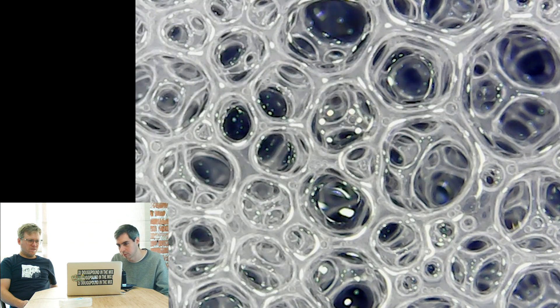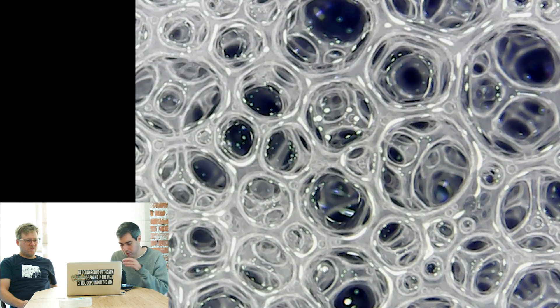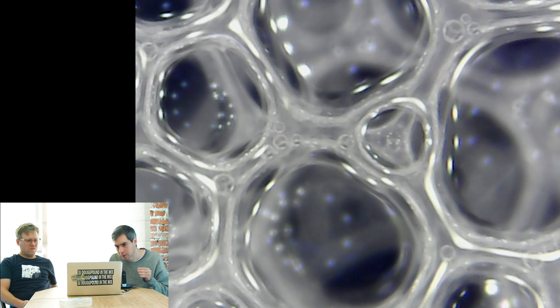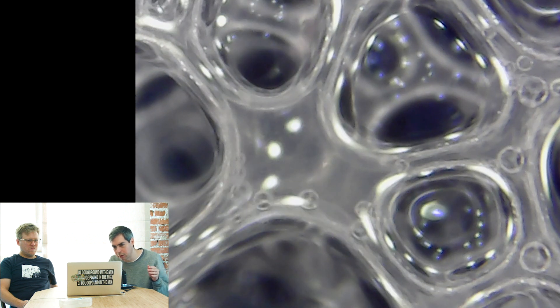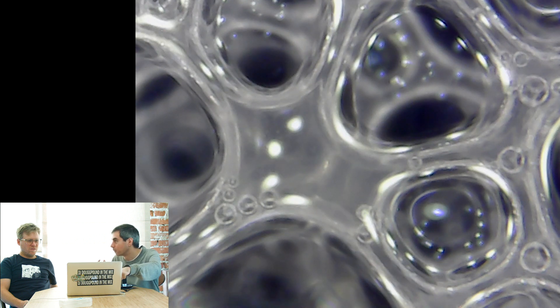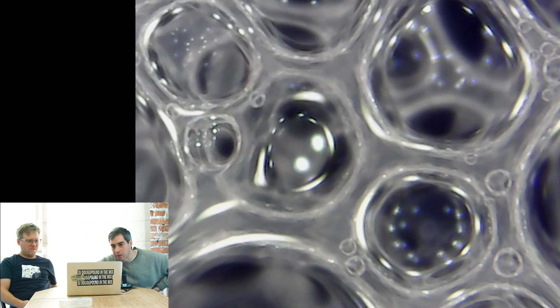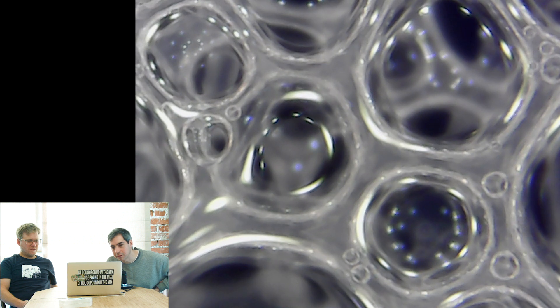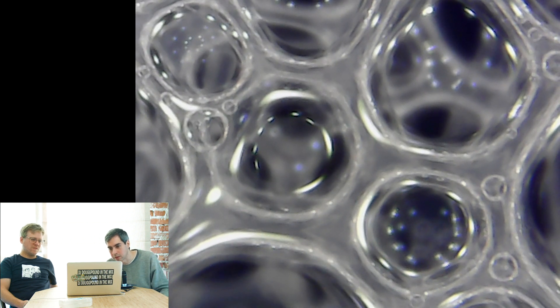The bubble channel — just all bubbles all day. Look at these little bubbles that are on the bigger ridges, kind of moving along. Maybe we can see that closer. Okay, this is really neat. That is really cool. Look at that — these little mini bubbles. That is awesome! These little mini bubbles — wow, this is great. I love it. Oh, that is so neat! Look at it closely — the liquid, how the juice is flowing. That's so neat. You can see the juices flowing on there.